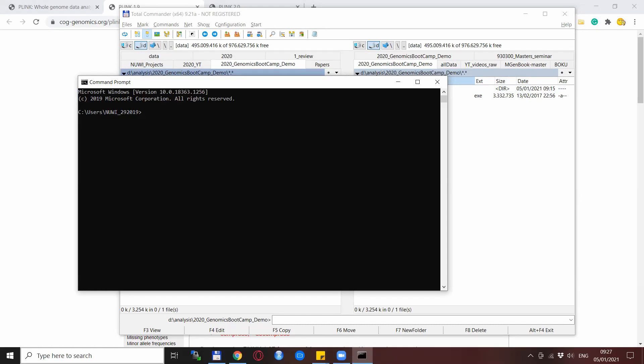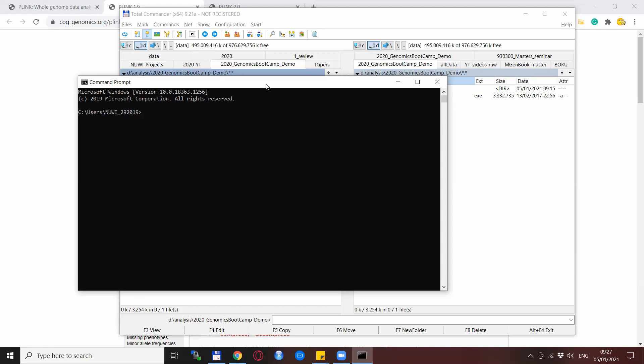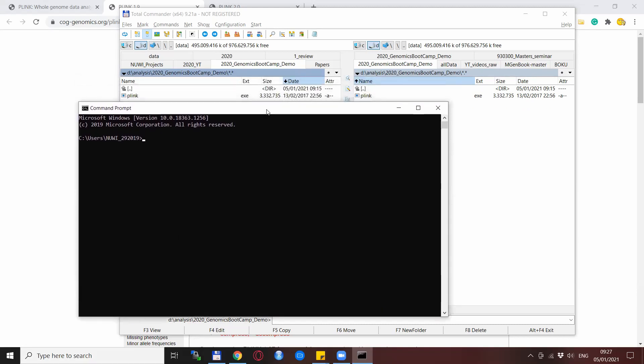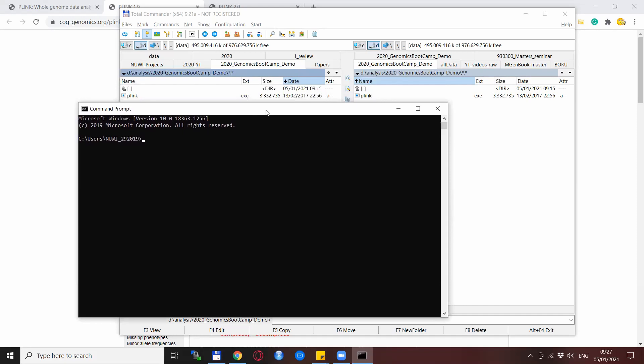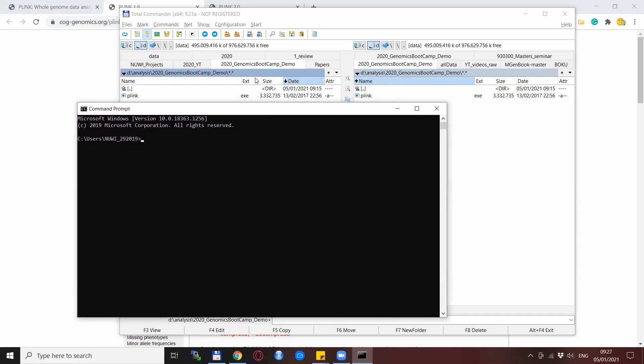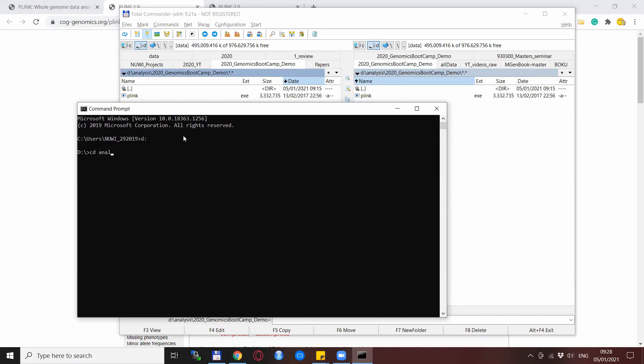Now you need to navigate to the place where the plink.exe file is located. So for me this is on the D drive, analysis, and the genomics bootcamp demo file. If you need to change the drive, you just put the drive name, so in this case D and the colon, and that changes to the drive. Then when you need to change to directories you type cd as for change directory, space, and the directory name, in my case analysis.